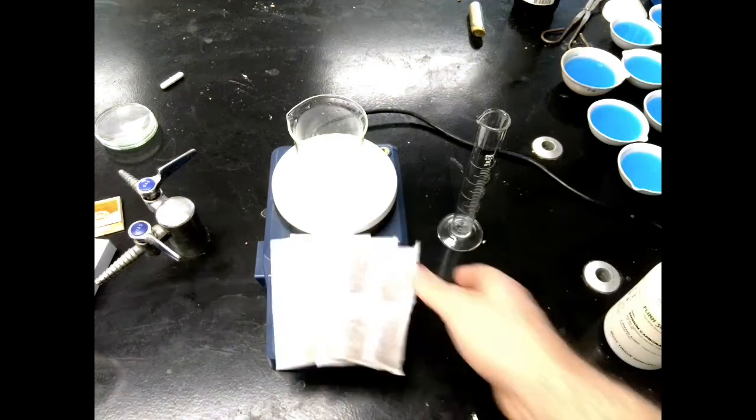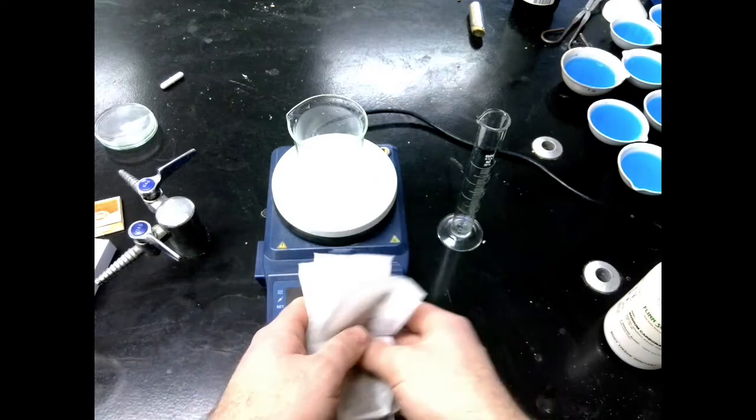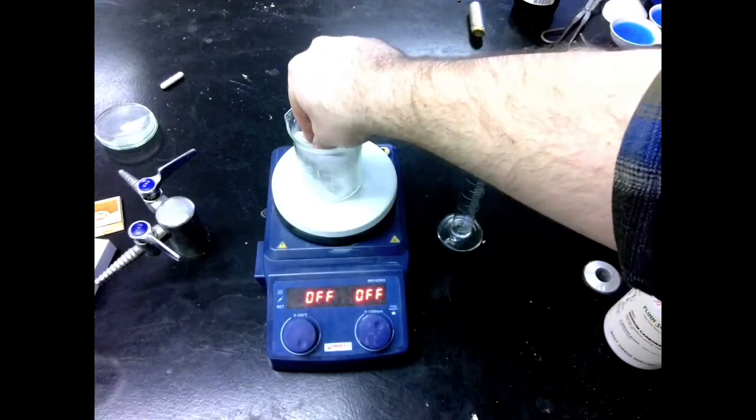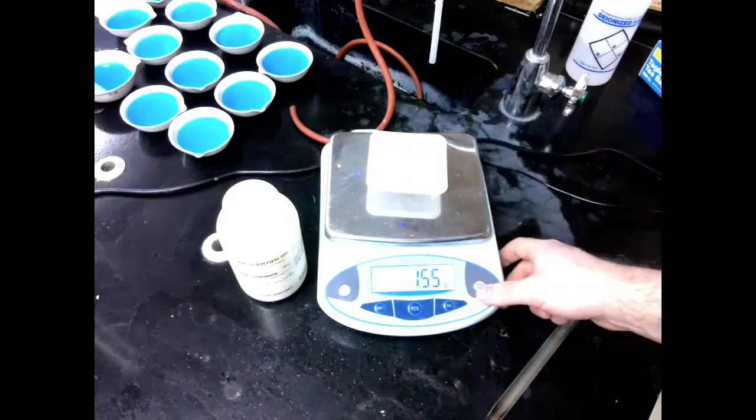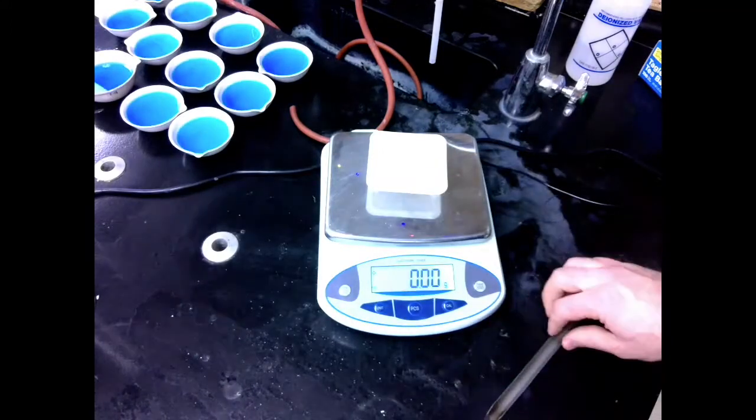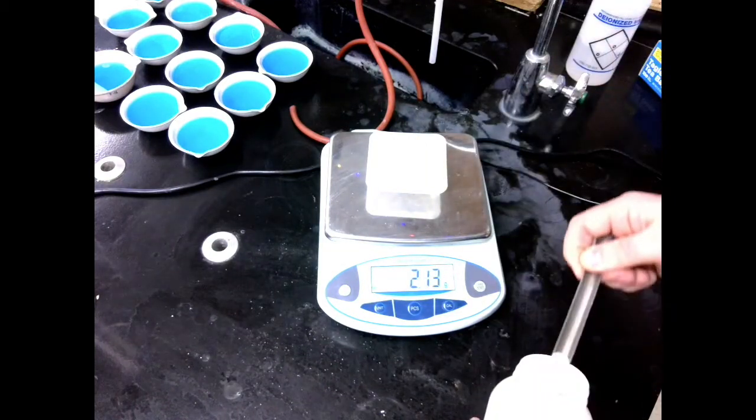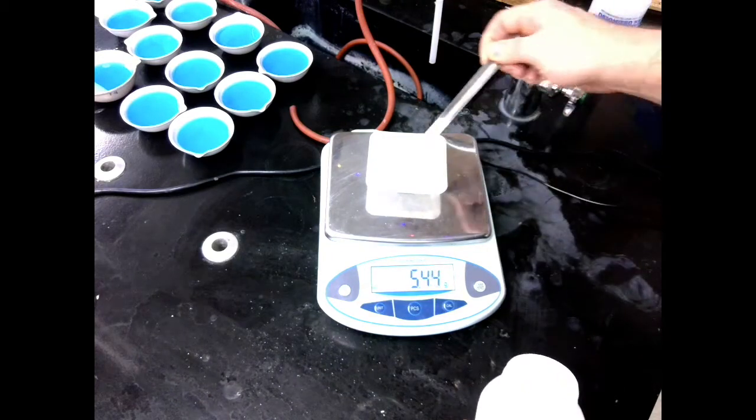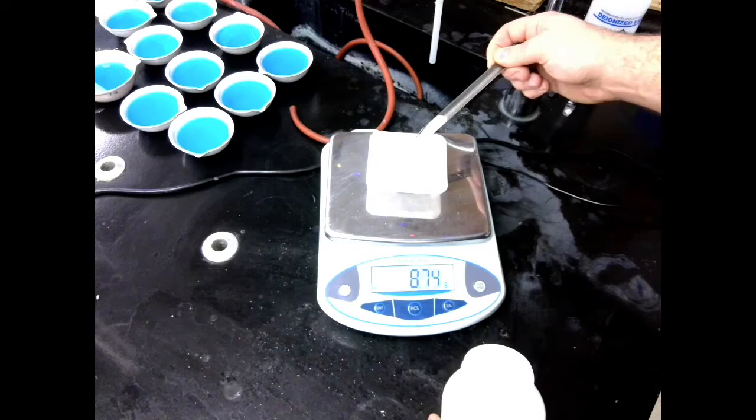Our first step is to get some teabags. We have 10 teabags here. We're going to put those all into a beaker, and then we need to measure out some sodium carbonate. We're going to measure out about 10 grams, so zero out our scale, and weigh out about 10. The sodium carbonate here is going to help everything that is not the caffeine stay suspended in the tea solution when we extract the caffeine.